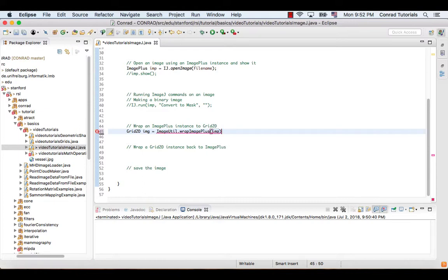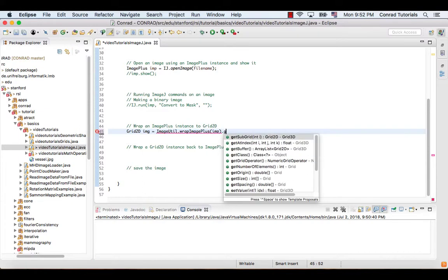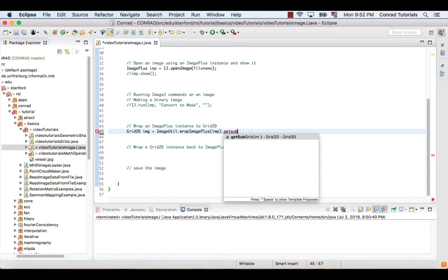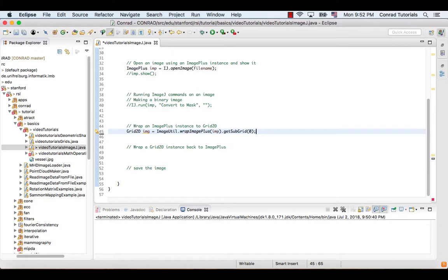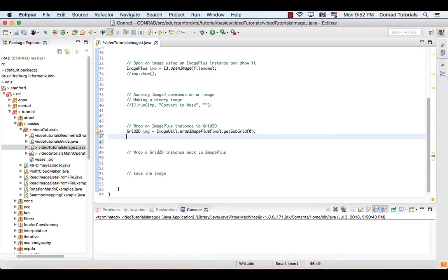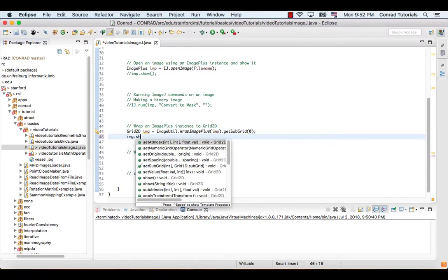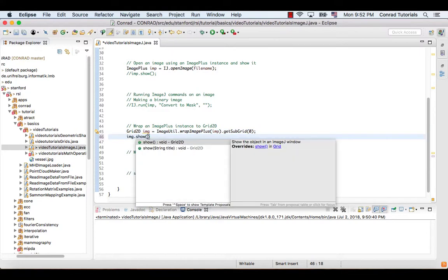Since the returned object has the type Grid3D, we can use the function getSubgrid to obtain the only 2D grid with an index 0. And then we can display the image using its member function show.